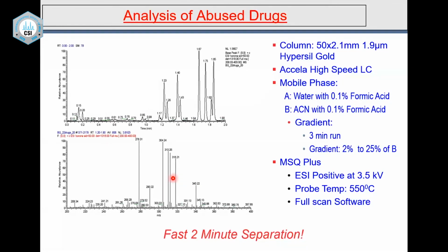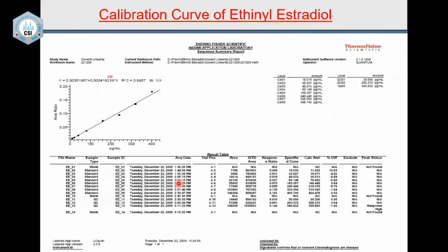You have to see that when you get something like that, you have to even doubt that it could be a mixture. But such a spectrum you can get from LC-MS and LC-MS/MS. And this is the quantitation. You can do a very good quantitation. I'm not going through details of that.